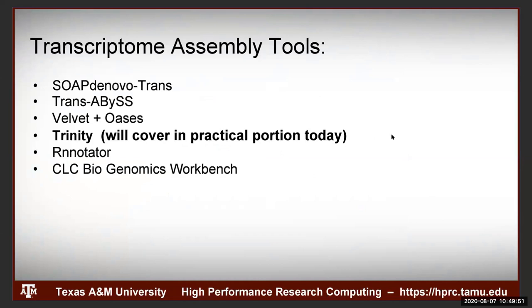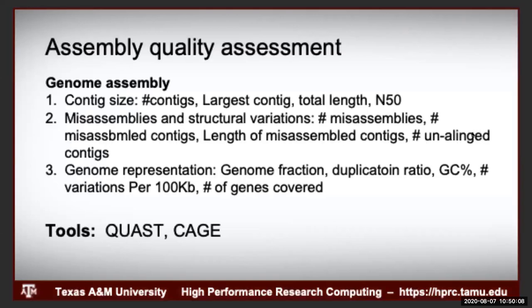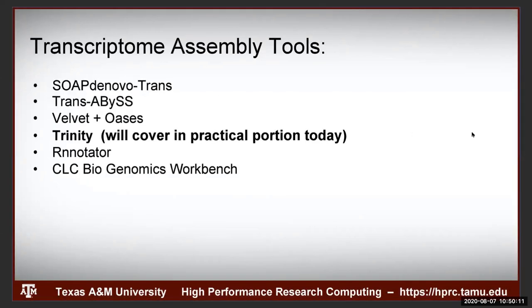So once you have finished the transcriptome assembly, you want to know the functions. For example, you want to have the open reading frames predicted. So Trinity has a tool for doing that too. You can annotate the possible molecular function for you. So we'll be running a small Trinity assembly today with Galaxy.